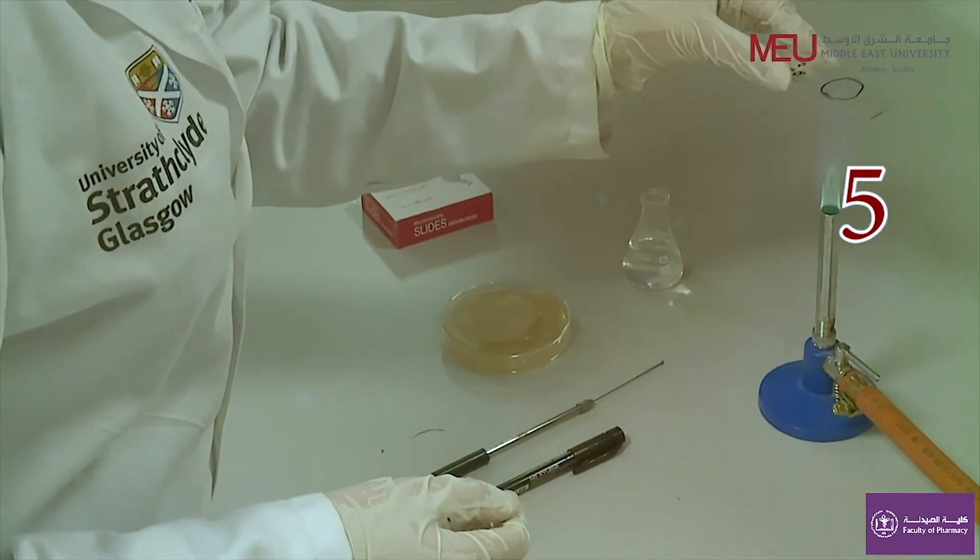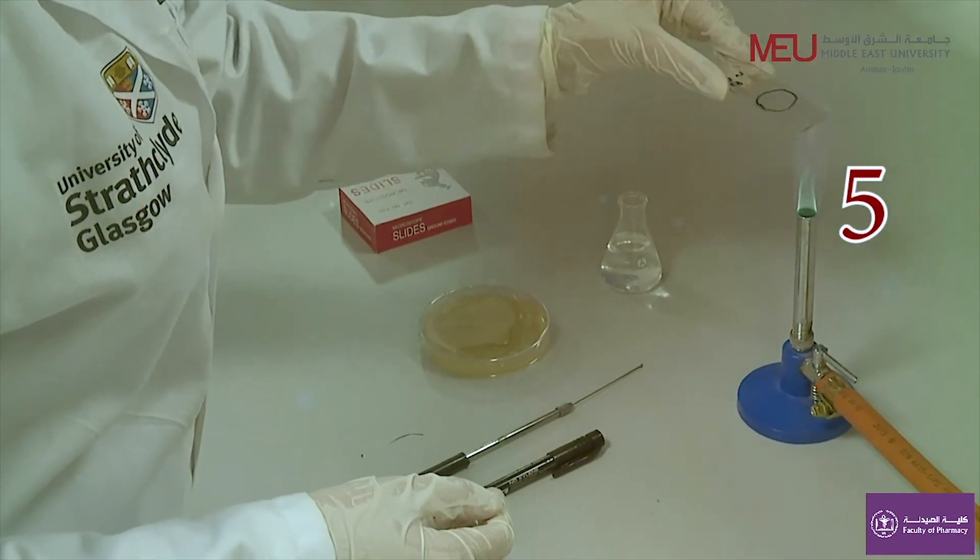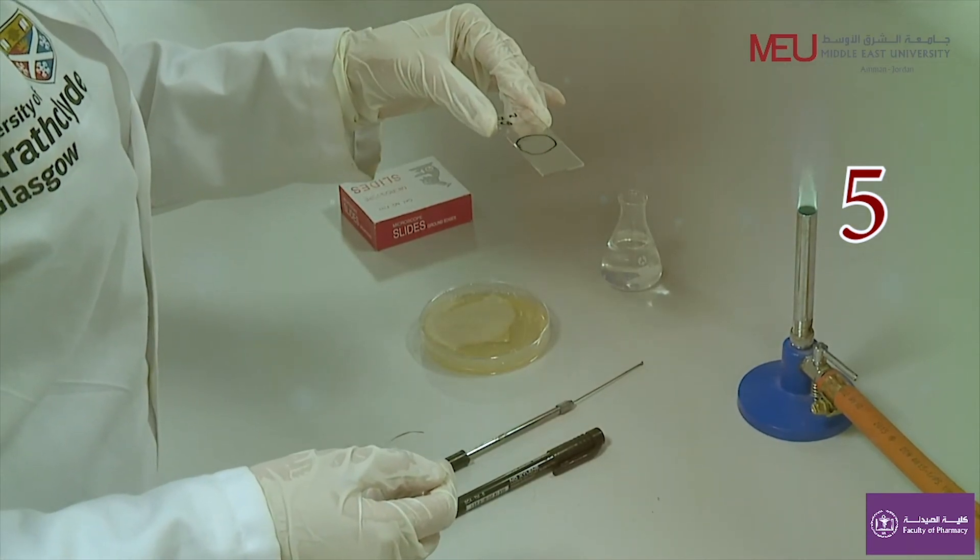Once dried, heat fix the smear to the slide by passing the bottom of the slide through the tip of the Bunsen burner flame two to three times.